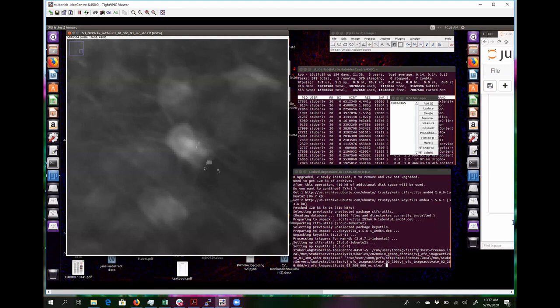So how do you then draw ROIs for these cells if you can't draw across the whole thing? You can use the same principle. Remember, the purpose is that you want to draw a region of interest where there's nothing inside that region that's not part of the cell. So every pixel inside should be part of this cell.